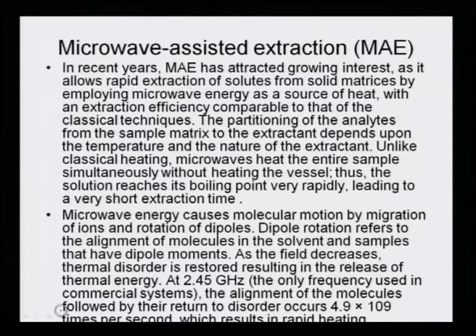At 2.45 gigahertz, the only frequency used in commercial microwave systems, the alignment of the molecules followed by their return to disorder occurs 4.9 times 10 to the power 9 times per second, which results in rapid heating. So, that is what actually causes the molecular excitation, and that is how the heat is generated in this case.